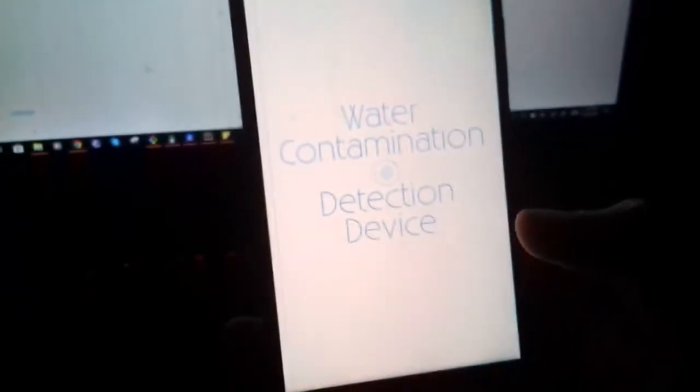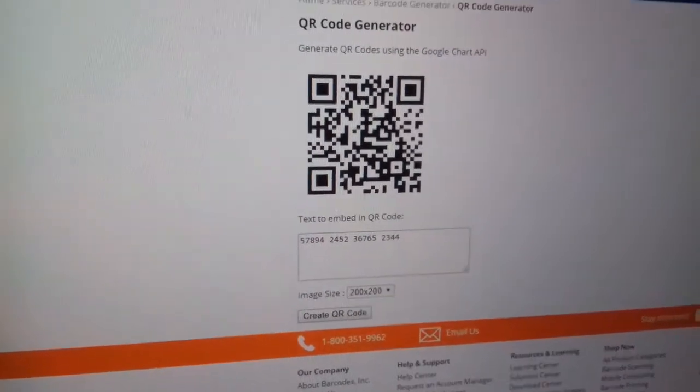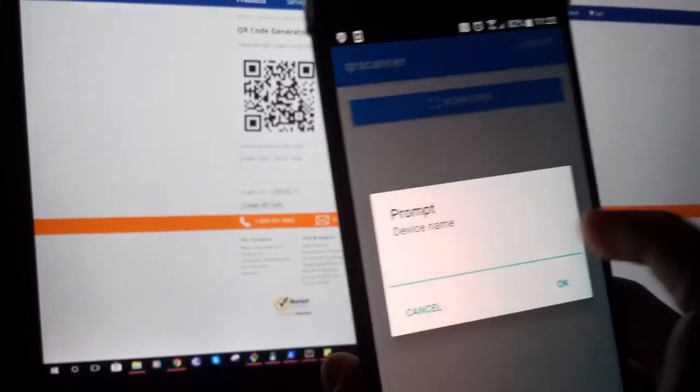So here on the app, this is currently a blank user who has no data. A normal user has access to a full report, a summary, and a QR code scanner, so they can add a new device. It will bring up the scanner. Then we're just testing. We have a QR with a serial ID. So just scan it and it will prompt for a name.